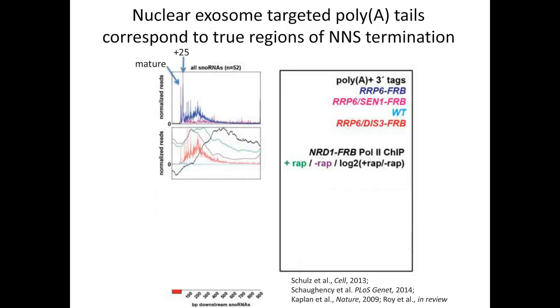Now, if we look at previous data that had examined RNA polymerase II occupancy by ChIP in cells that also have the Nrd1 subunit of the NNS pathway inactivated, we can see that the regions where RNA polymerase normally terminates agree well with the regions that we're identifying by the 3' end sequencing method. And the peaks that we identify in our sequencing methods agree well with the inactivation of the NNS pathway and where the RNA polymerase seems to no longer terminate, as you can see in green.